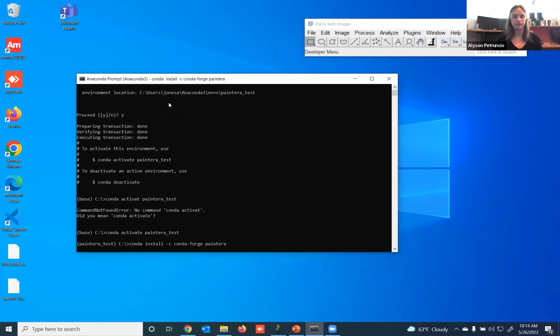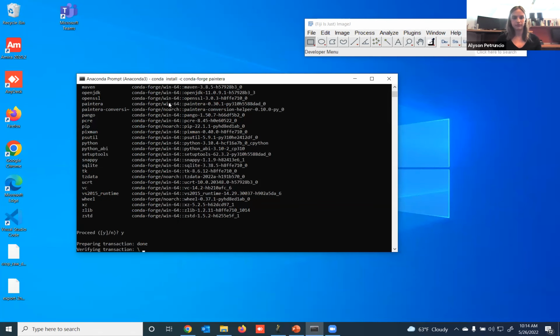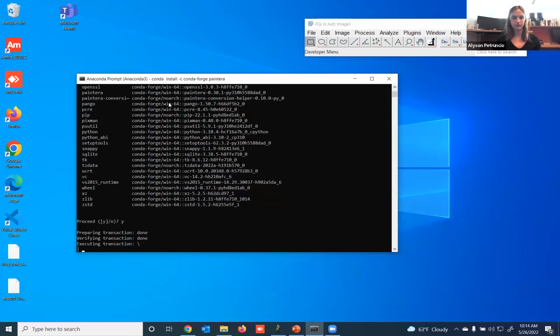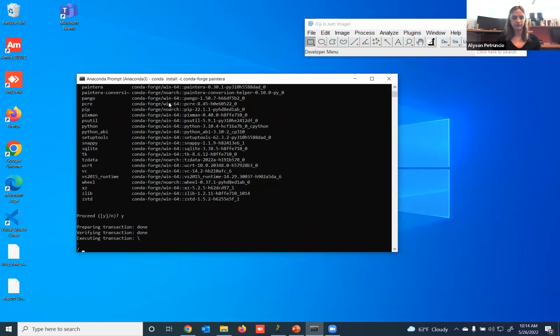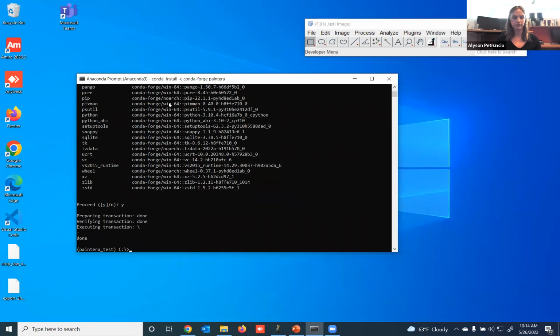Install Paintera. All right, great. So now we're in our environment. We now have Paintera installed and ready to go.